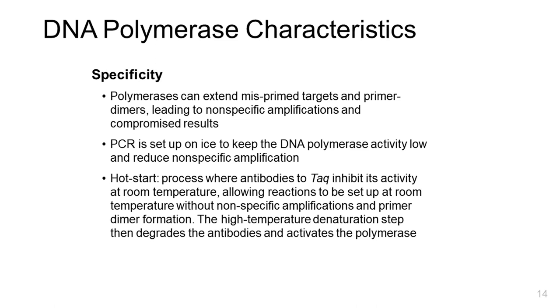There are four characteristics to DNA polymerase. One of these is specificity. We know that polymerases can extend misprimed targets and primer dimers, and this can lead to nonspecific amplifications and compromised results of your PCR experiment.